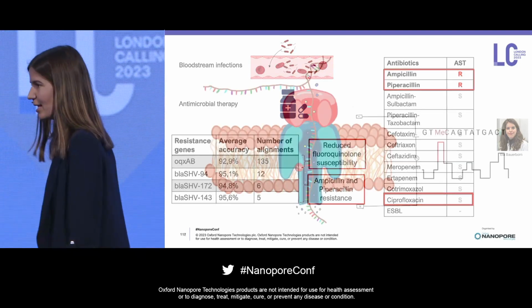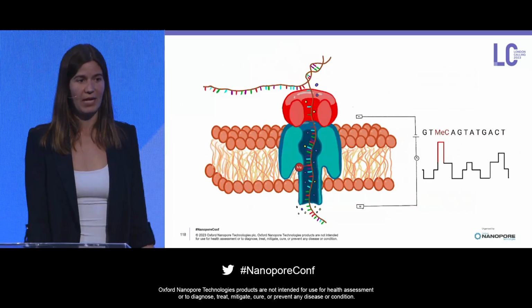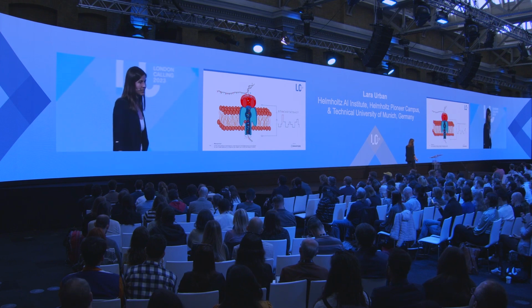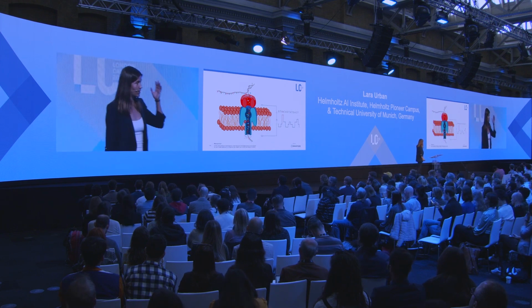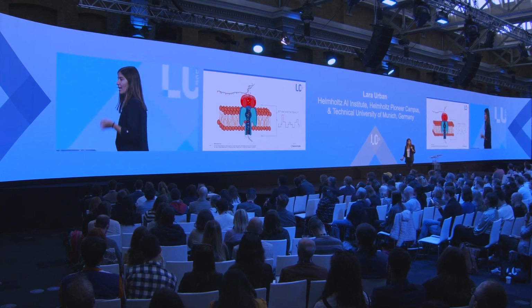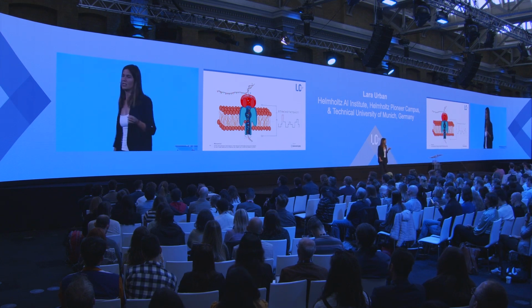But coming back to the question that I had, right? When we find pathogens or any other organisms, do we know if this DNA came from dead or alive organisms? So we had a little bit of a crazy idea that maybe we could leverage that squiggle data detects differences on the atomic level in the DNA, and use this to distinguish DNA from dead and living organisms, under the assumption that when a microorganism dies, the DNA gets exposed to environmental damage, such as increased temperature, humidity, UV.